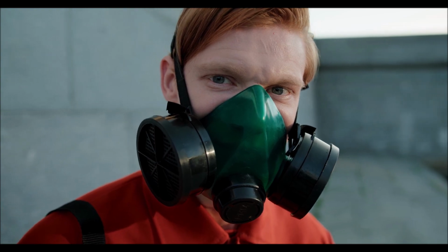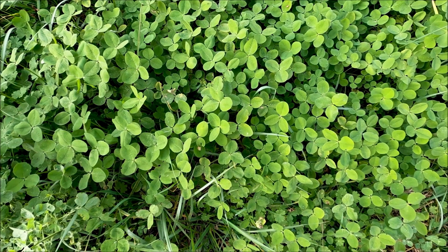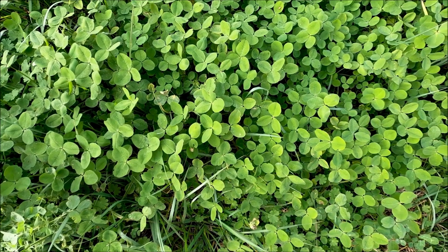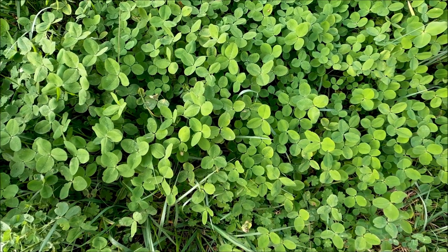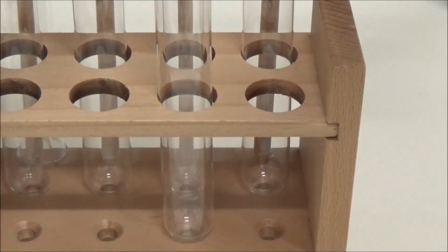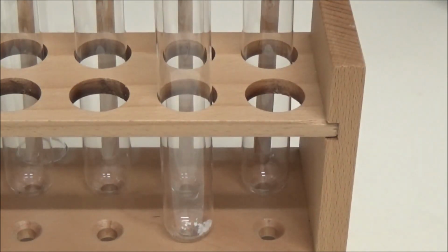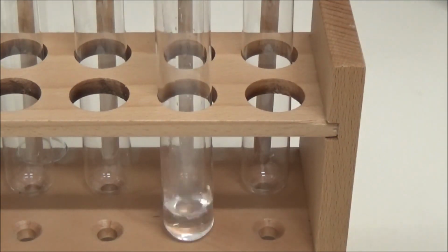High time for production in a laboratory. We make it by pyrolyzing potassium oxalate, which we synthesized in the last video. This occurs as a natural component in clover, so we produce a heating and poison gas from a meadowherb mineral. We use a diamine silver complex solution to detect the gas. Since it tends to form explosive decomposition products, it must be prepared fresh and used immediately.